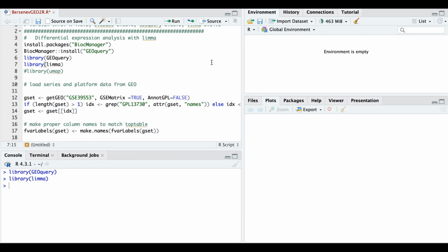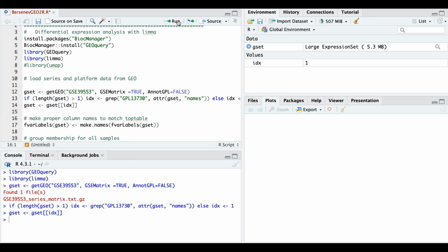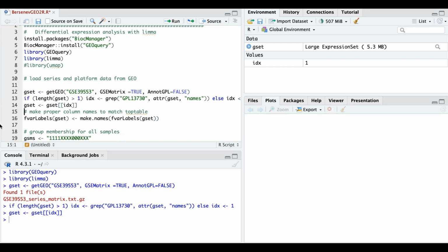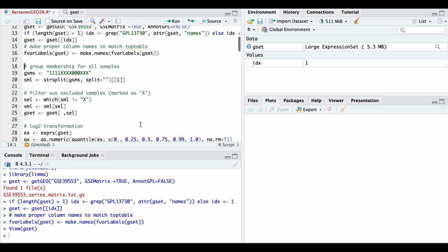Limma has its own dimensionality reduction plot, which you can use instead. So then the first lines are as is, because you simply import data from the sites indicated in NCBI GEO. It sounds like gibberish, but you better follow it. And then this line is also needed. But from here you will make modifications.